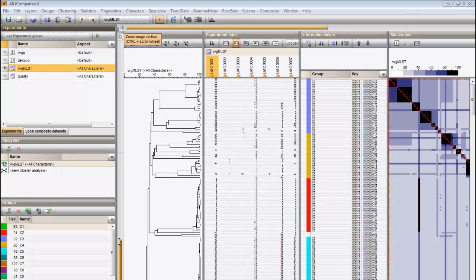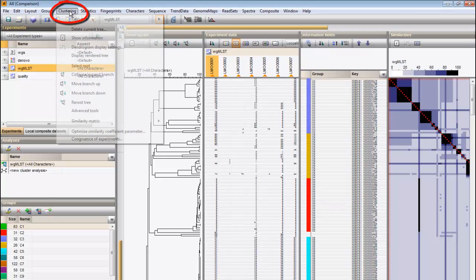Alternatively, a minimum spanning tree can be calculated in the advanced cluster analysis window.